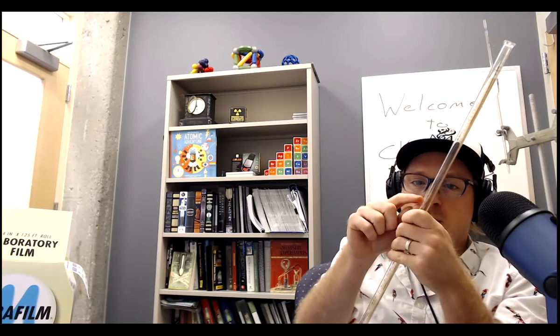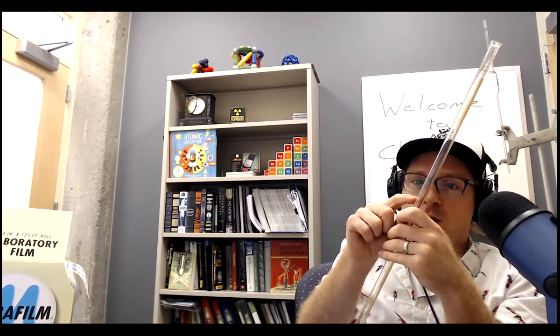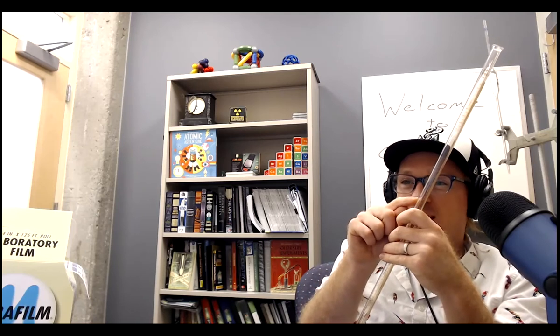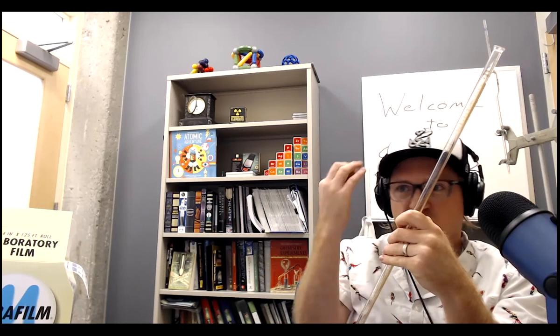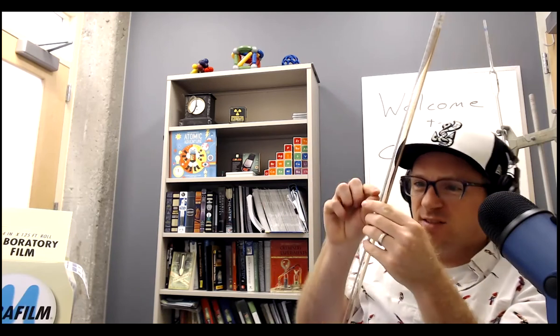Whenever you're reading the burette, read it to 2 decimal points. So that is 0.00. If it was right on the 10 milliliter line, call it 10.00. If it's right on the line after 18, call it 18.10. If it's between 18.5 and 18.6, and it looks like it's right in the middle, call it 18.55. You always have to estimate the meniscus between the two lines.